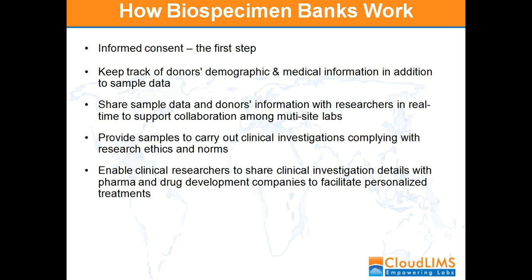And once we receive the request for the biosample projects, the projects are evaluated by the biobank manager, and then by the tissue release board. The release board looks at the scientific and ethical point of view, and once approved by the tissue release board, samples are provided to the researchers for their research purposes. So these are the steps by which biospecimen biobanks work.